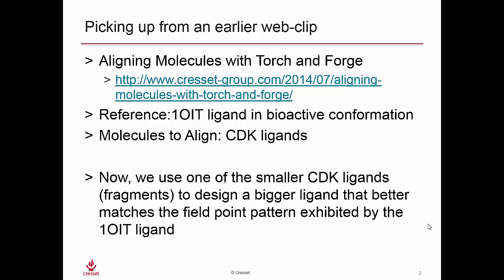In this case, we used a reference which was a ligand in a bioactive conformation from the 1OIT crystal structure, and we had a series of cyclin-dependent kinase ligands that we were aligning to that 1OIT ligand.